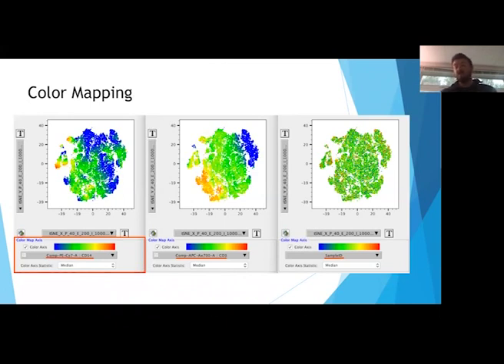If your samples are distinct enough, they may be clustered out by t-SNE, and that might not be a huge issue. But especially if you haven't done something like downsampling ahead of time, you might be worried that the mapping will be biased by a particular sample.